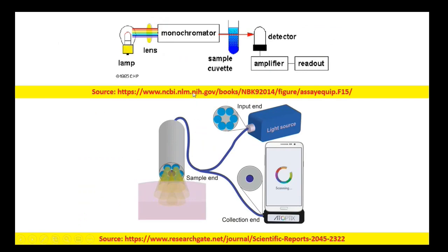Then we put an integral from I0 to I, and dx means it is the subcell or subpart of the original sample holder. So it is minus alpha C integral of 0 to b dx.